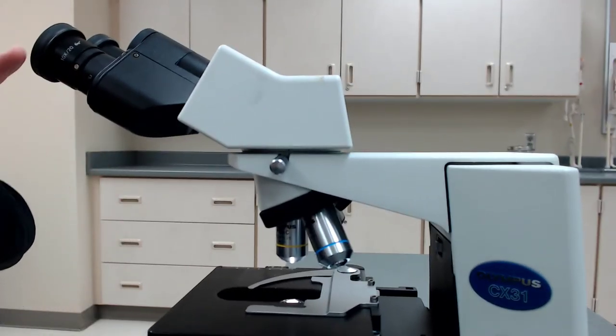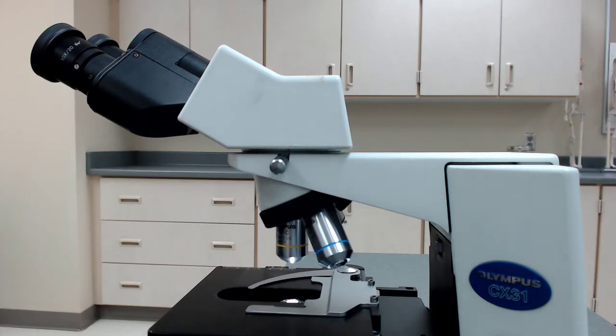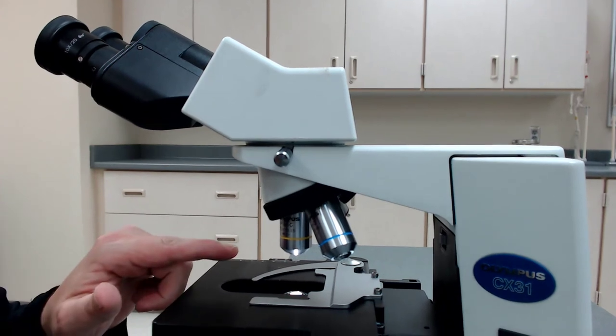So you have an objective there, and there's a second lens system up in the ocular. So I don't know how well you can see it, but this says 10x right here. So you actually, if you're figuring out the total magnification, you take your objective, which in this case was 10x, and multiply it by the 10x here in the ocular.